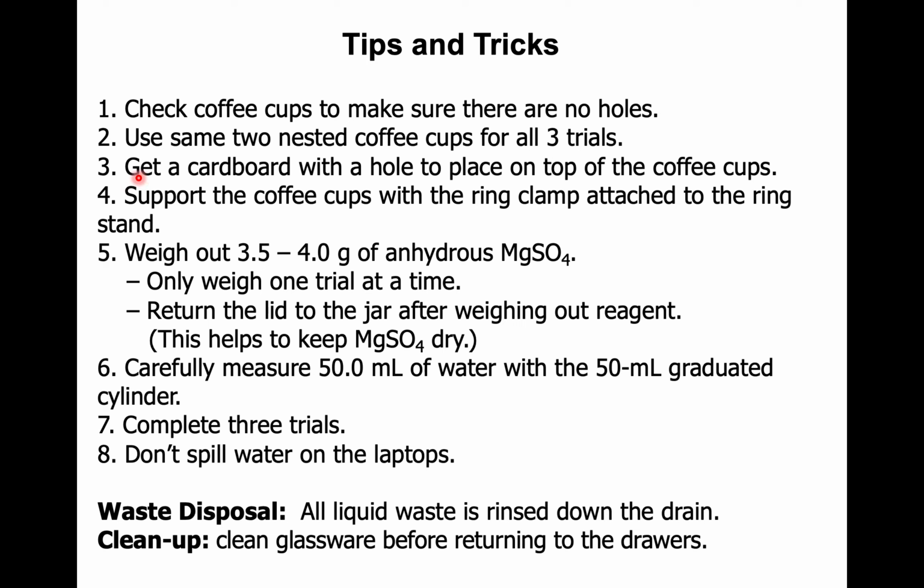You want to get a cardboard with a hole to place on top of the coffee cups to minimize how much heat you're losing to the environment. You want to support the coffee cups with a ring stand so they don't tip over.